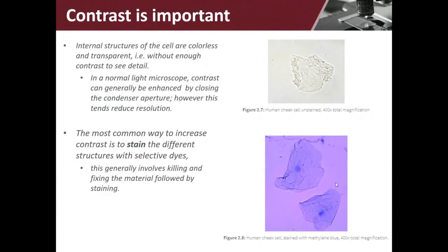Okay, the other part of microscopy that's really important has to do with the fact that most cells are transparent. Now, plant cells aren't, they have chloroplasts, but a lot of cells are. In fact, cheek cells, for example, are transparent. You can see right through them.